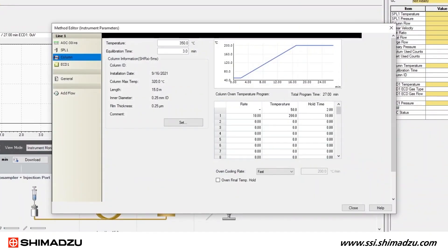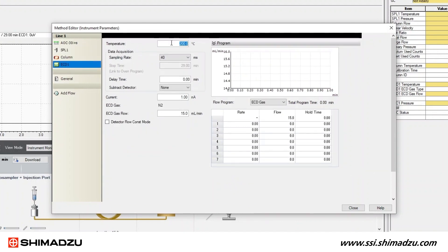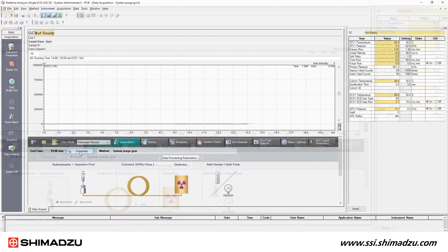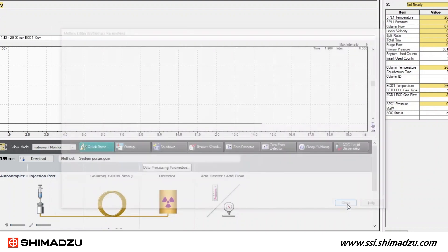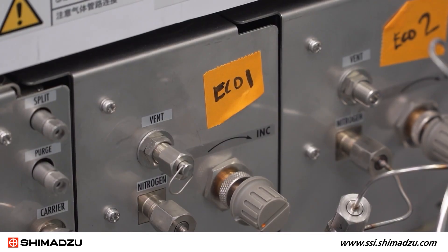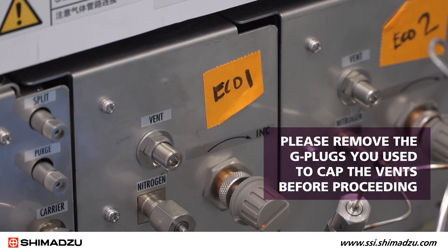If you use the software for this step, set the temperatures in the different zones and then save as a new method. Be sure to download the method to apply it to the GC. If you normally use splitless injection method, open the method editor and change that setting to split mode for purging the GC. Make sure to save and download the method. If you normally use high pressure injection method or cryogenic cooling, change to not use for purging. If you have capped off any vents in the back of the GC, such as ECD vents for extended storage, please remove the plugs you used to cap the vents before proceeding.